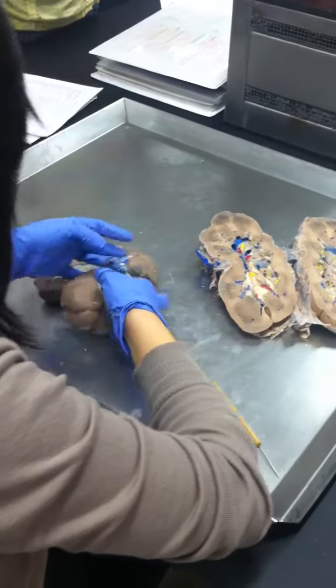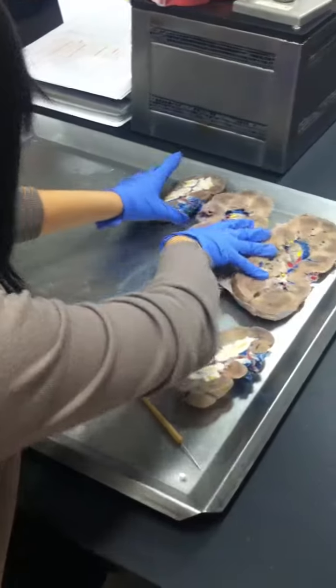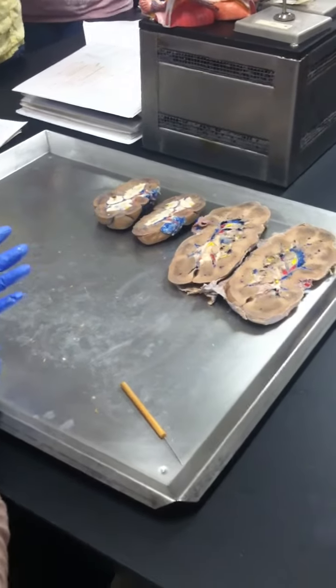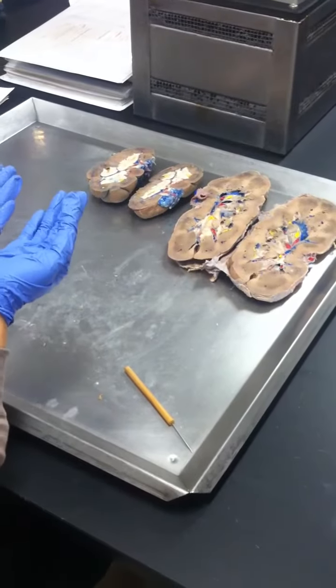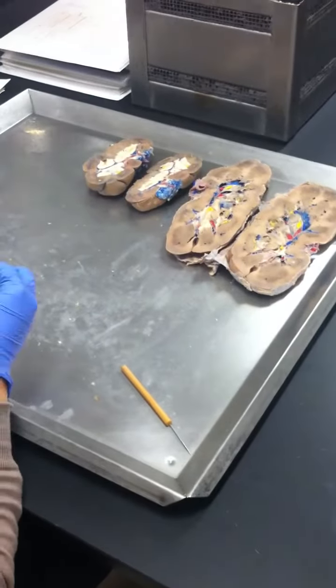Awesome. So you can definitely check out the kidneys when you're doing your cat dissections. What you can do at this time is take out your cat and try to see similar structures within your cat kidney. Slice it in half, open it up, and see if you can see similar structures. All right, so we'll do that for the next couple of minutes.